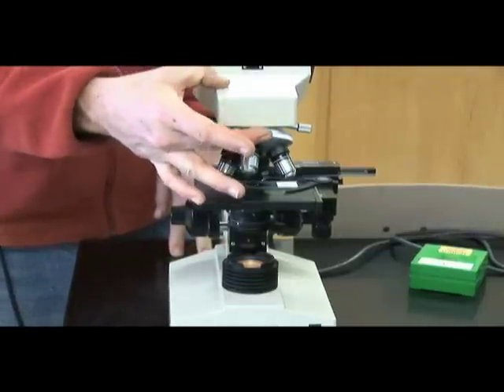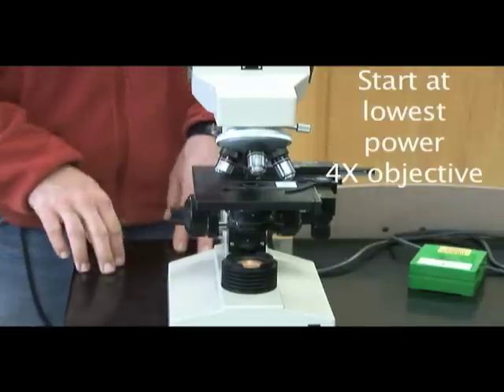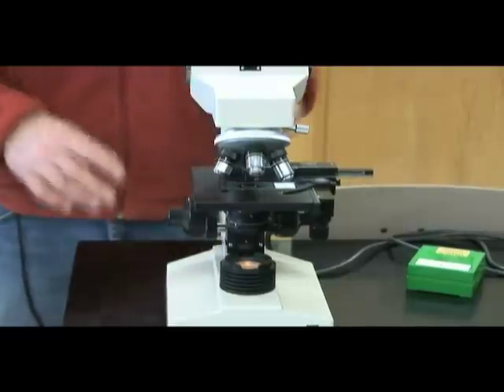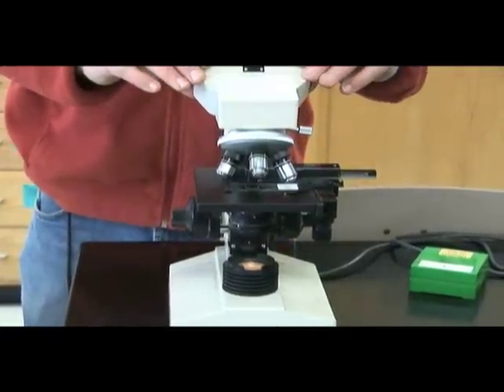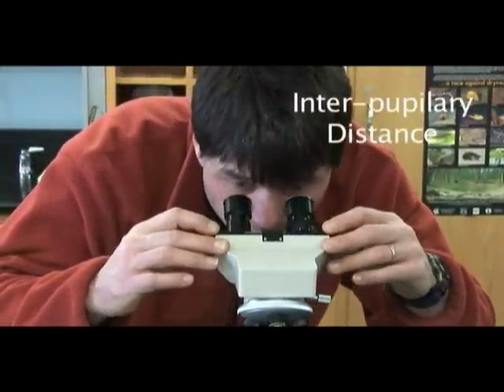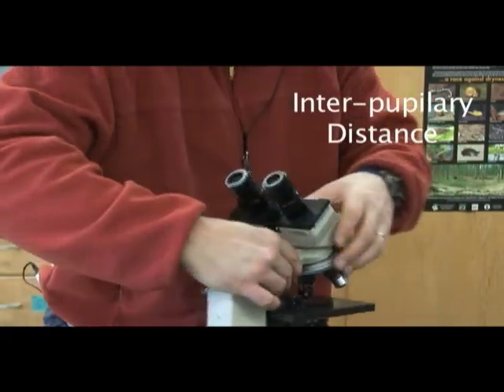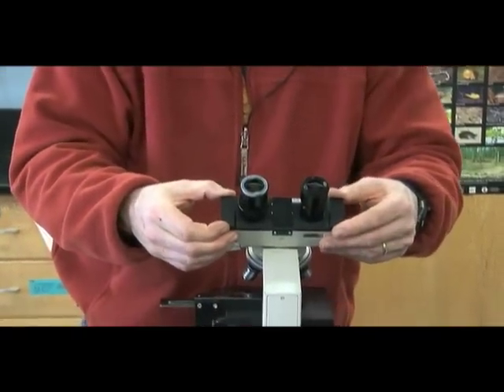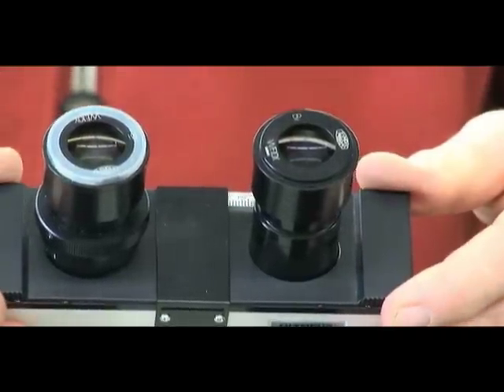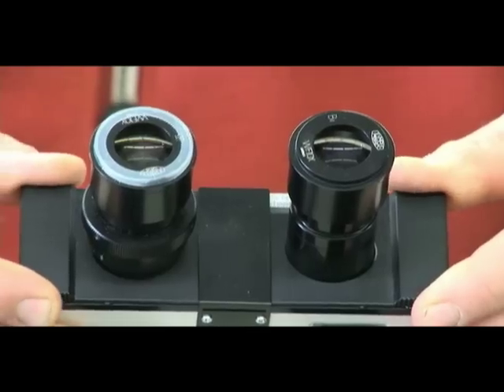So to set this scope up, we always start at the scanning or the lowest power objective, the 4x objective, and we need to first adjust the scope to our eyes and then adjust the focus. Adjusting it to our eyes first, the interpupillary distance, or the distance between our eyes, we want to move this slider back and forth until we see a perfect circle in our view. Seeing two images, or having to close one eye, means that you don't have the proper interpupillary distance.